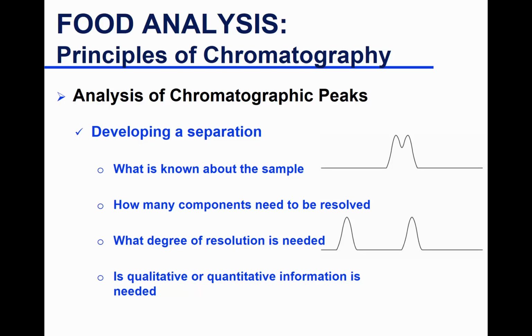You can still probably look at the spectra, which is when you plot absorbance over wavelength. So you can say, well, I can detect the spectra for this one, and I can detect the spectra for that one. I can identify them. So sometimes you do not need that grade of resolution, and sometimes you really do, depending on what the purpose is.